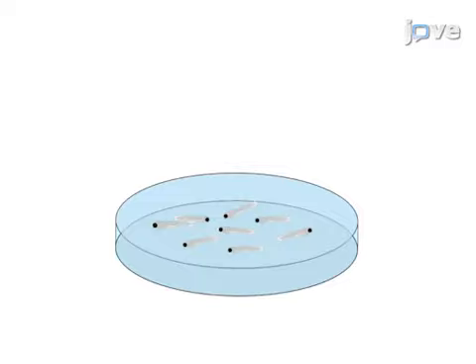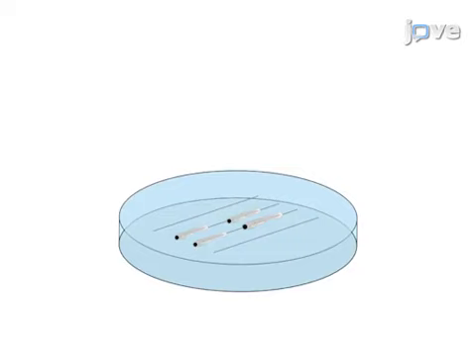Next, the embryos are transferred to an injection mold and orientated so that their hearts are to the left of the field of view.